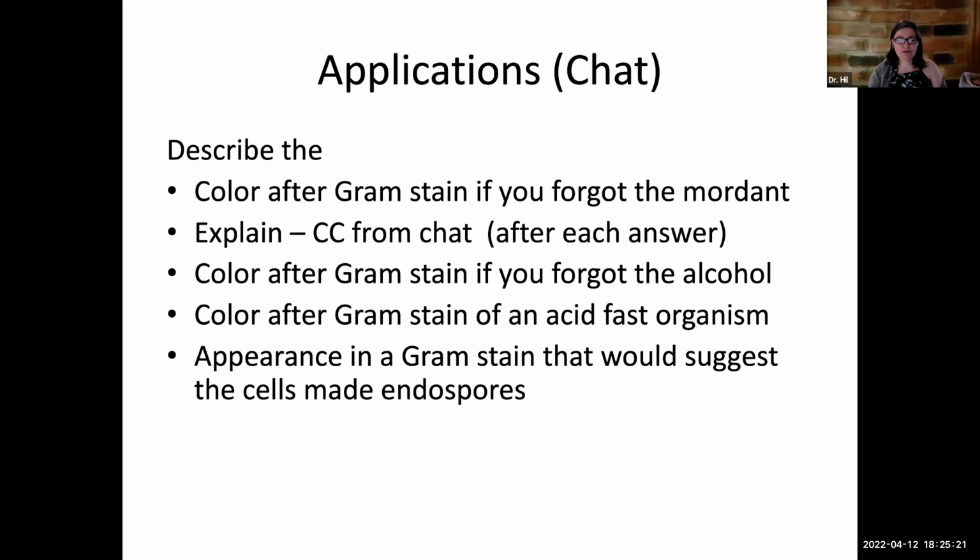Okay, if you did a Gram stain, could there be any circumstance where you look at the result of your Gram stain and you might say to yourself, I wonder if these cells make endospores? What kind of appearance might you see in a Gram stain that would suggest that to you? Write that into the chat.